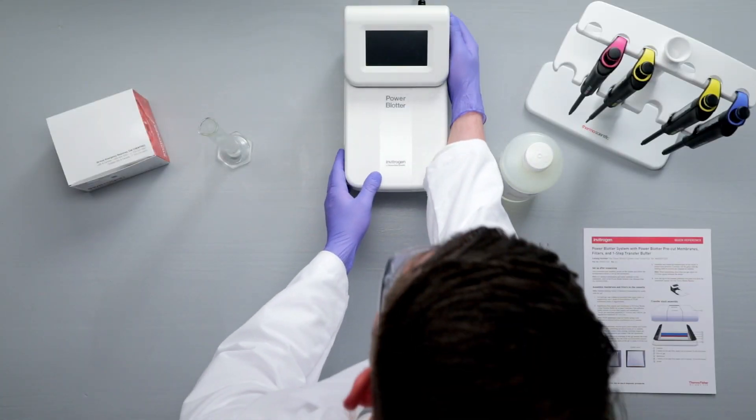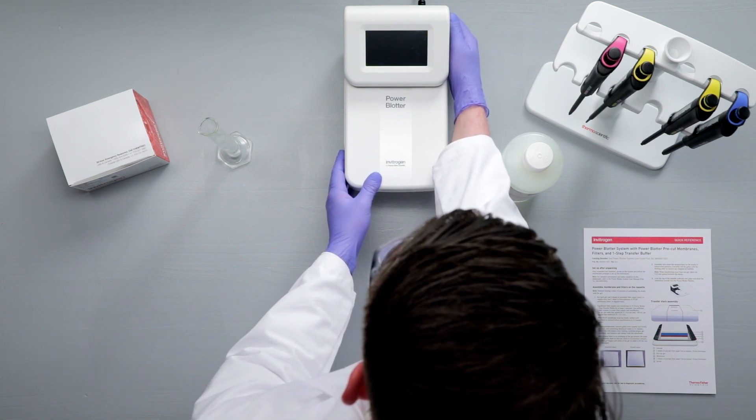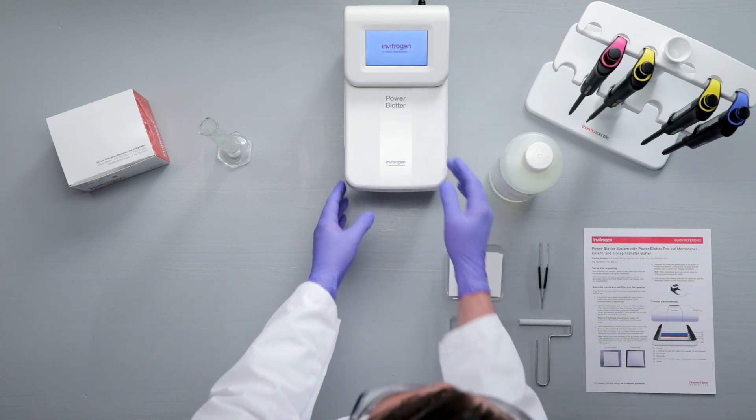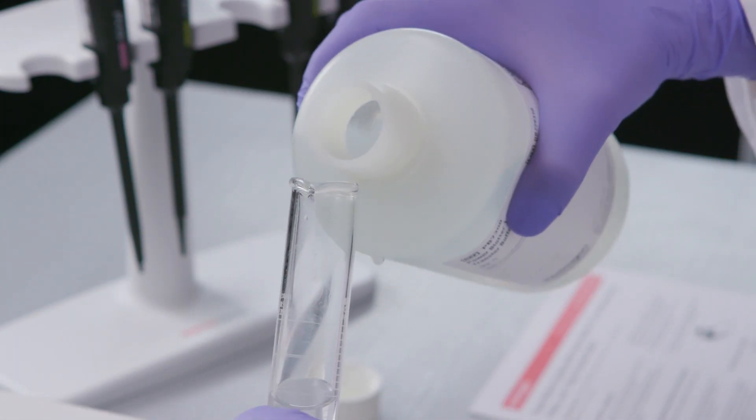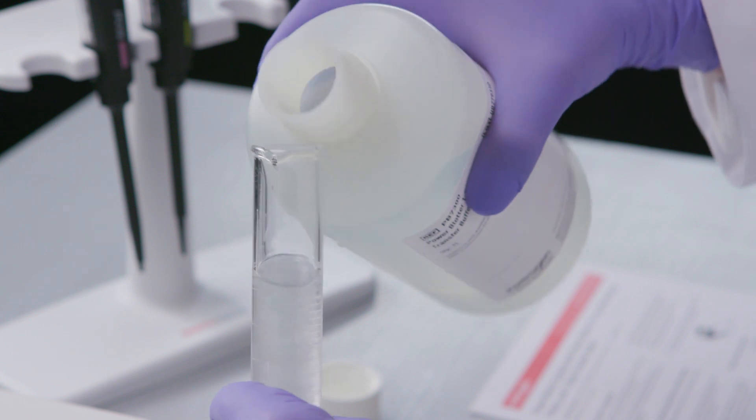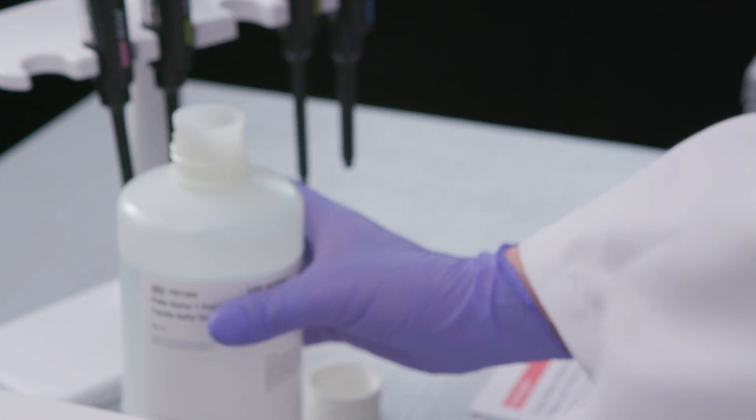To begin the transfer process, flip the power switch at the rear of the device to turn on the system. The Power Blotter One-Step Transfer Buffer comes in a 5x concentration. Before using, dilute to a 1x concentration using deionized water.